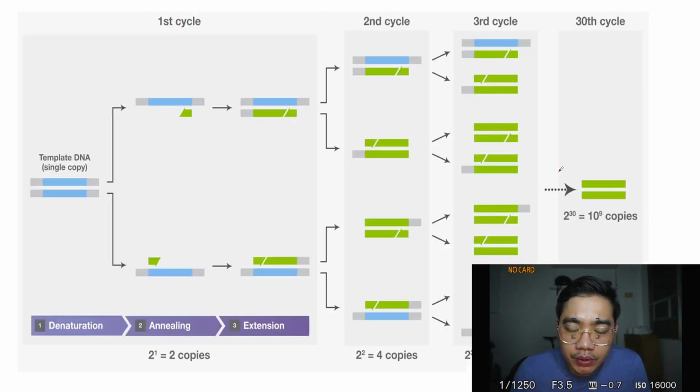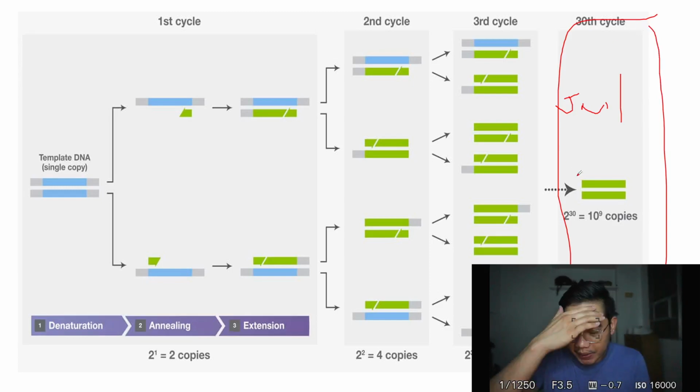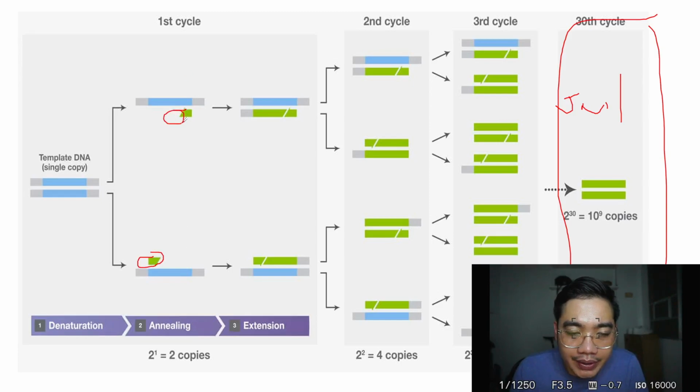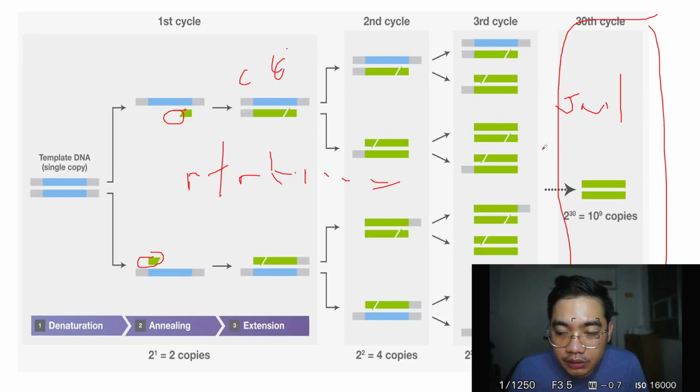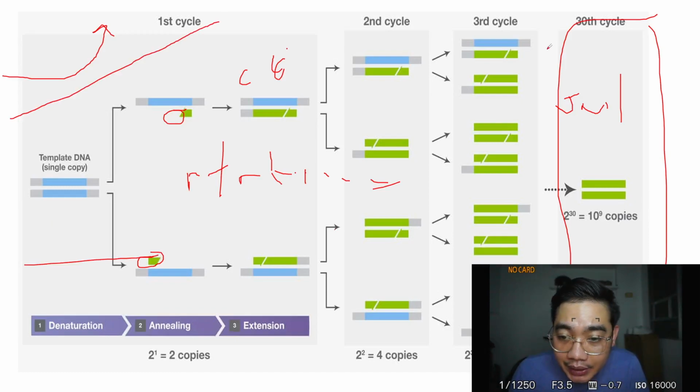So the beauty of PCR is even if the amount of DNA is small, we can still detect it, no? After we get a lot of copies, we can check if our primers work. Sometimes we add, as in real-time reverse transcriptase PCR, quenchers and fluorophores, so we can check if there is an increase in the target gene amplification. Amplification means the genes keep multiplying.